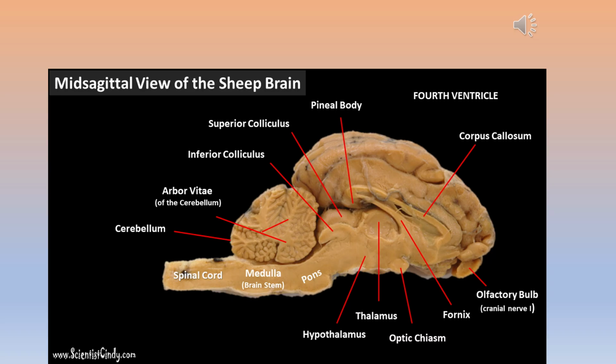Okay, now further along here in the mid-sagittal section, two slides previous, I was talking about taking the cerebellum and folding it down away from the cerebral hemispheres so that you could look down into that gap and see the region of the brain called the tectum.